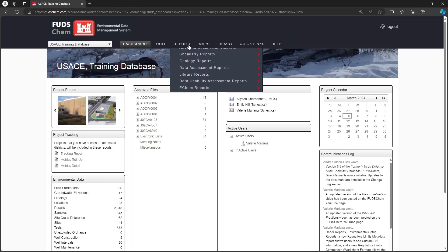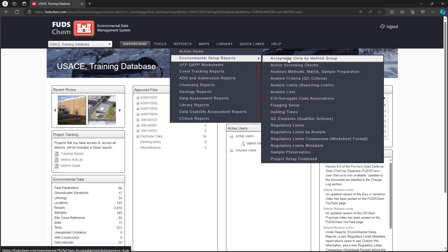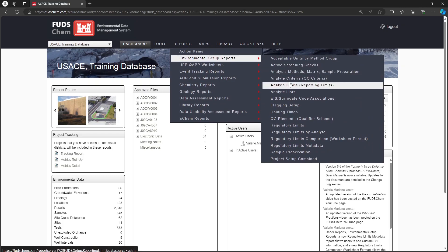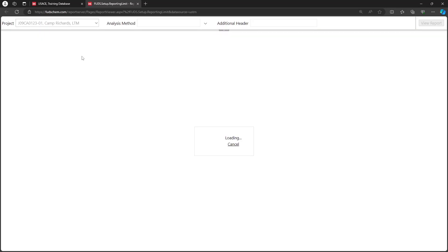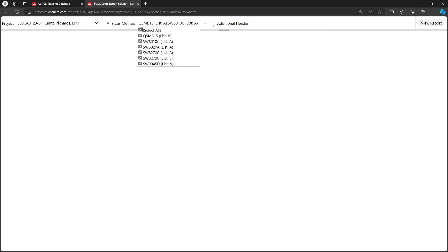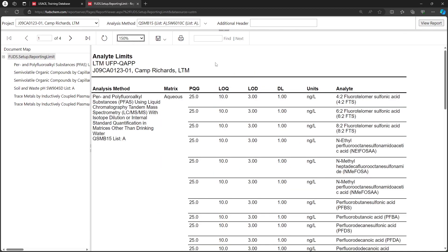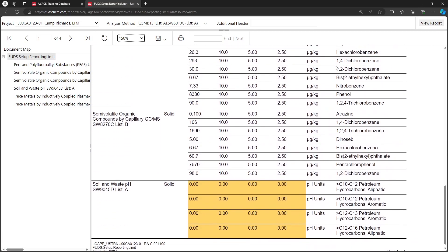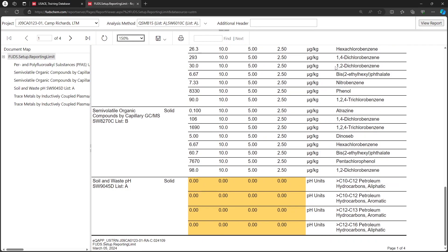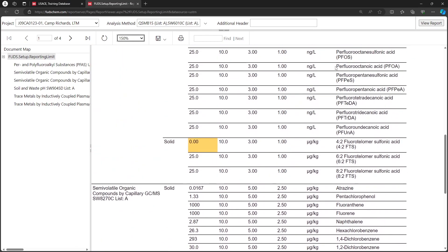Go to Reports, Environmental Setup Reports. Choose Analyte Limits, choose the project, adjust the Analysis Method drop-down if desired, then click View Report. This report lists the laboratory limits and project quantitation limit goals (PQGs) for each analyte as entered in the EQAP Analyte Limits tab. Any missing values are highlighted.